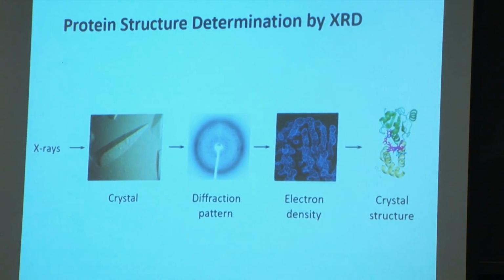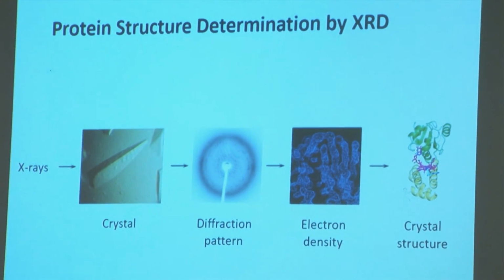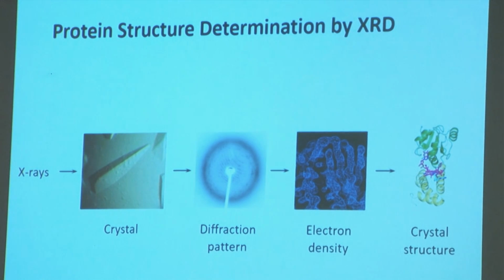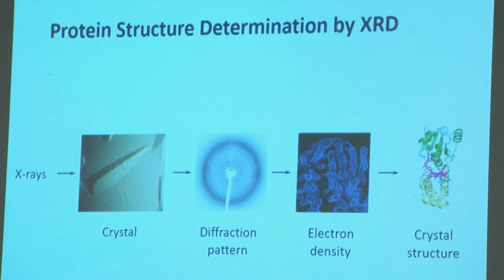And even now, the computers will get you up to a certain point, and then in the last stages of refinement, usually people do that by hand. Any questions about X-ray crystallography?